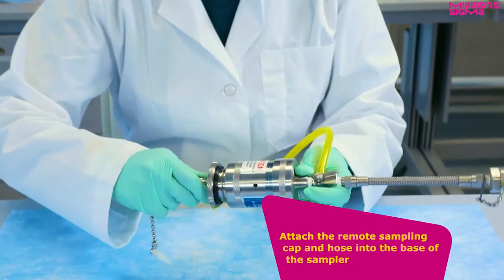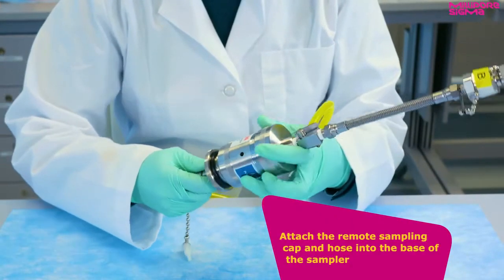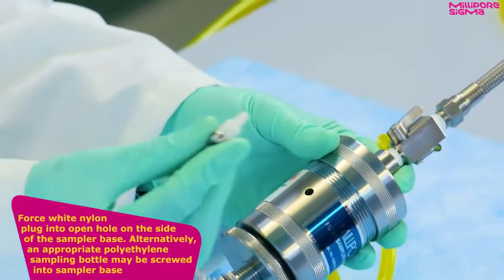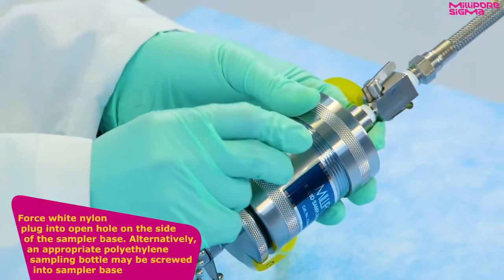Attach the remote sampling cap and hose into the base of the sampler. Next, force the white nylon plug into the open hole on the side of the sampler base.